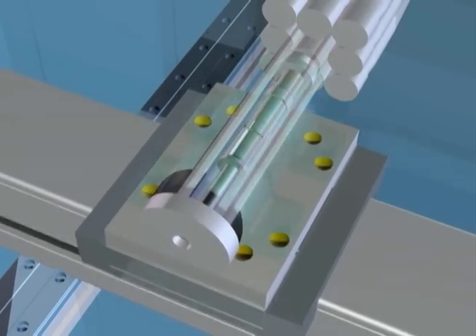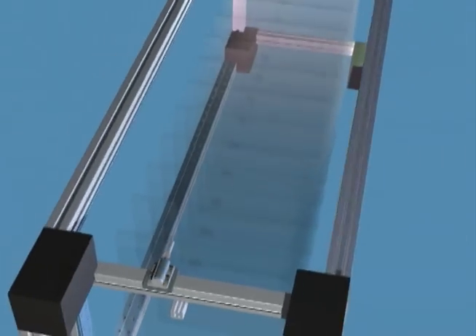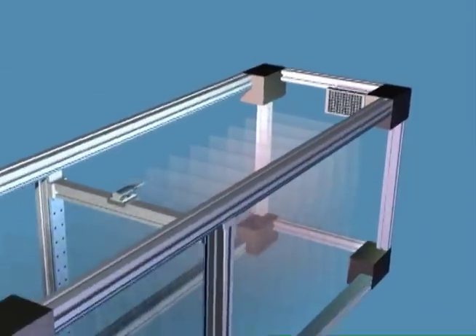The robot picks and places tubes inside the freezer rather than removing a rack and picking tubes outside of the cold environment.